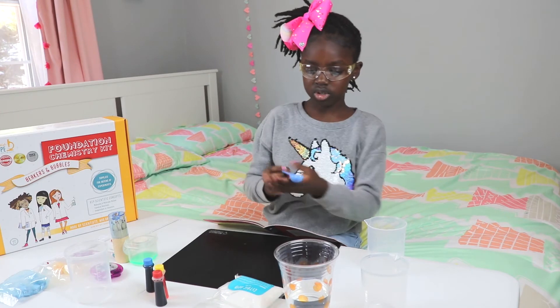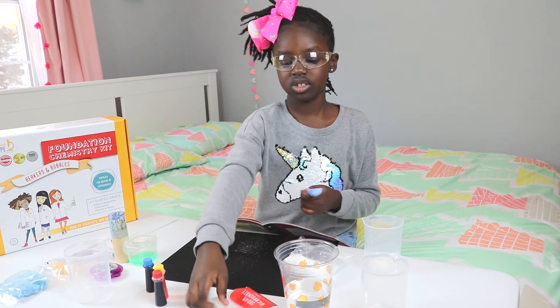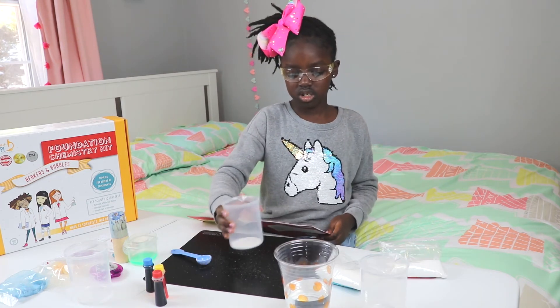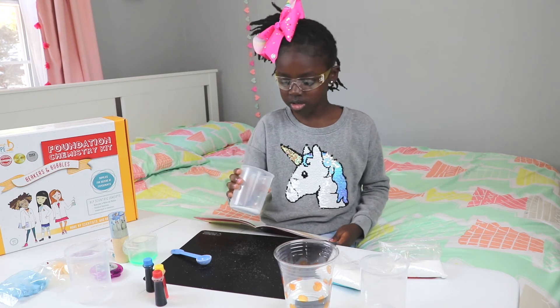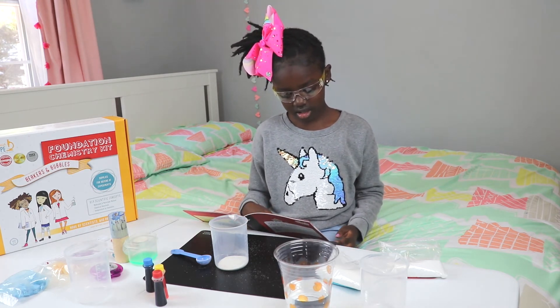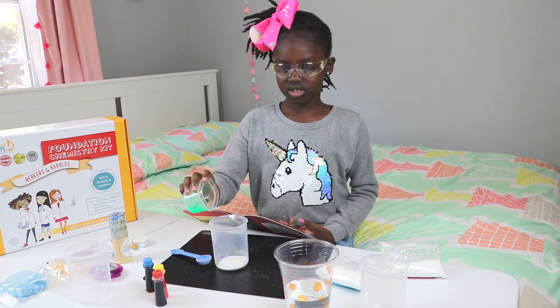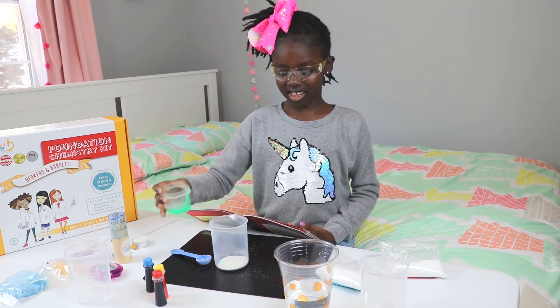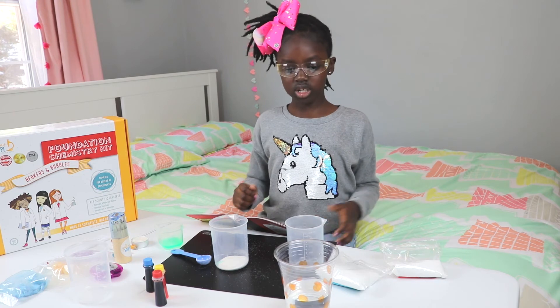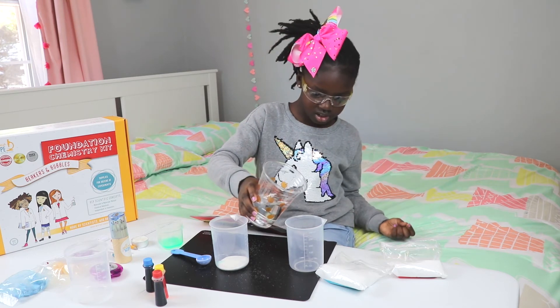One teaspoon of citric acid — beaker — and sodium bicarbonate, together like this. The powders are mixed. To the powders, add one teeny tiny drop of this soap. How do you tell if it's a drop? Drop — like that. And then fill the second beaker to 50 mL with cold tap water. Make sure it's still cold. Yeah, it's very cold. And fill it up until 50 mL.